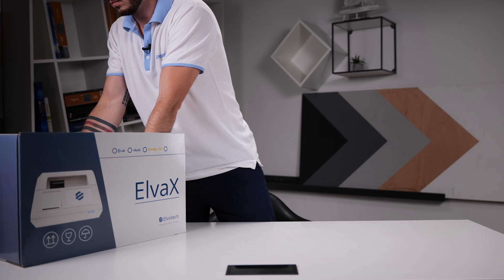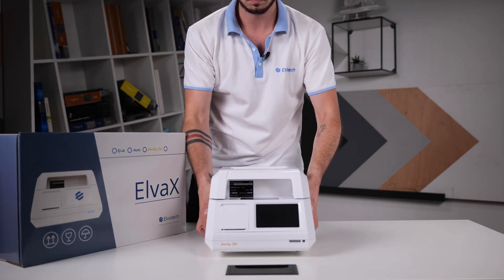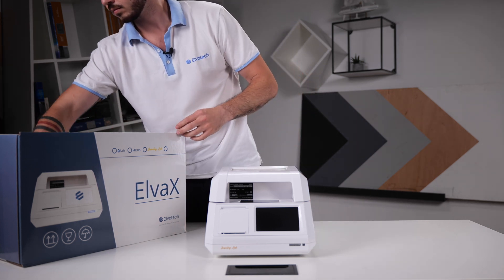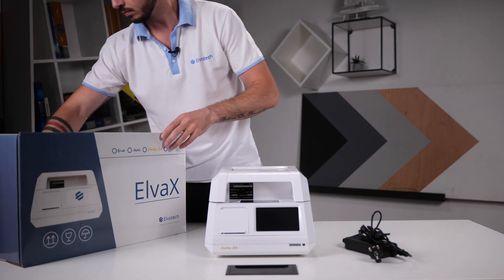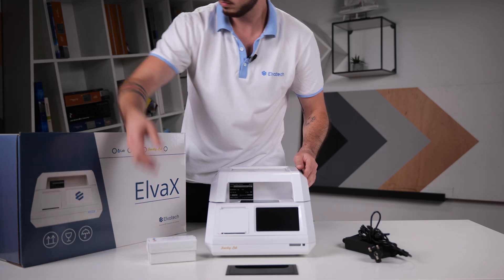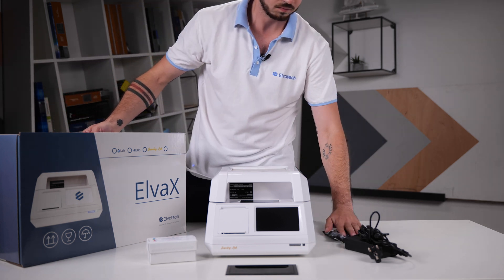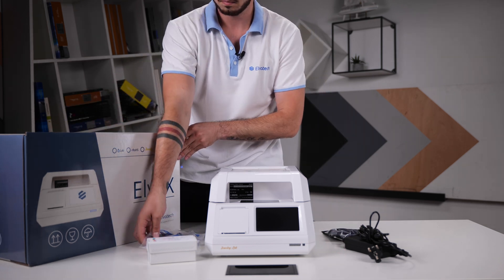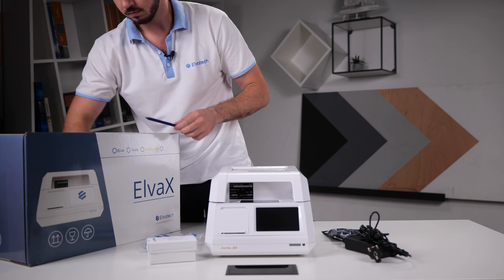Let's move on to the most interesting part, unboxing. Let's see what we have inside the box. Here we have the Javelry Lab analyzer itself — very compact and ergonomic. And this is the device's power supply. The kit also includes a stylus for the touchscreen display, a USB cable for connection to a computer, a test sample for calibration, and calibration and radiation certificates confirming the accuracy and safety of the device.